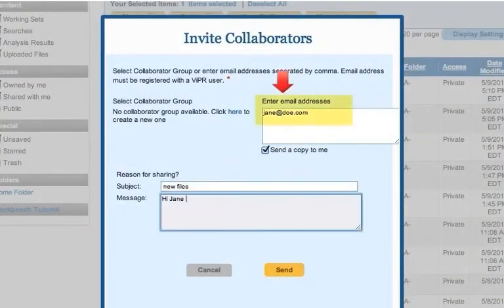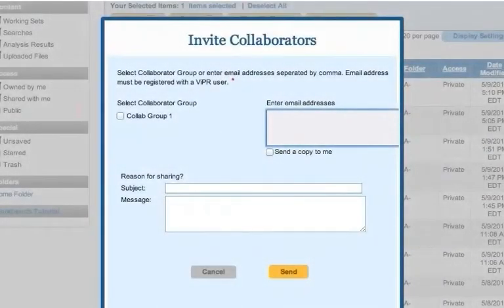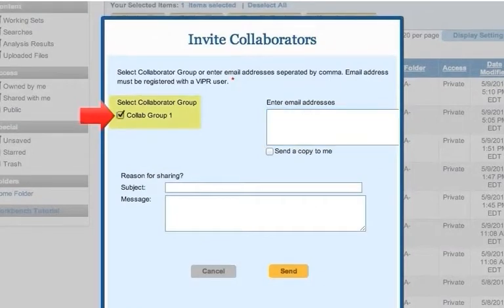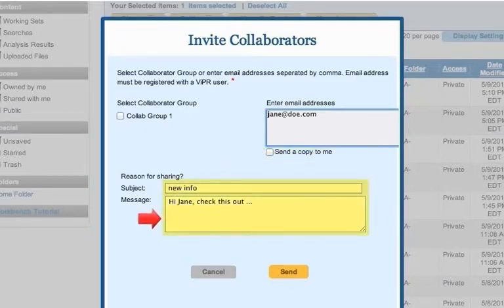You can enter the email address of the desired person. Or you can click the Select Collaborator group to specify a group that you have previously constructed within your workbench, or a combination of the two options. You can then choose whether to send yourself a copy of the invitation and whether to add a personal note to the invitation. Click the Send button to complete the invitation process.